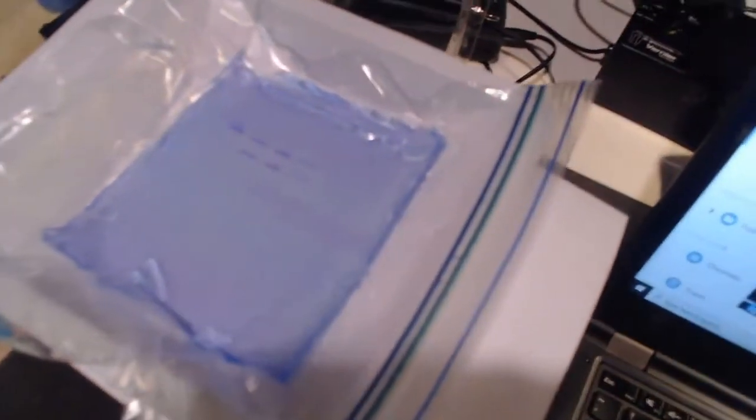I stained the gel, and we'll take a look at it without the light so far. We stained the gel with a stain called Carolina Blue. That stains the DNA. You can see the bands here a little bit, but I'll turn on the light. And here are the wells. The wells are where we loaded the DNA.